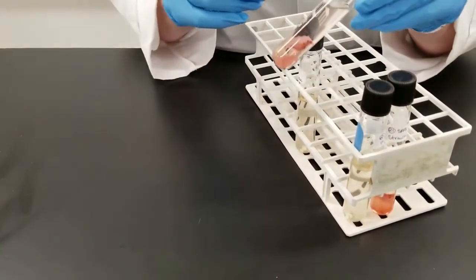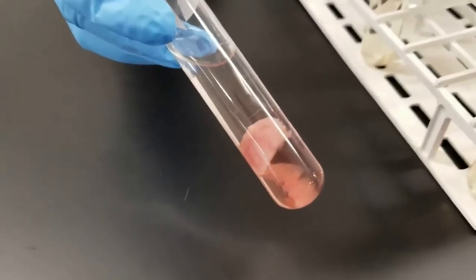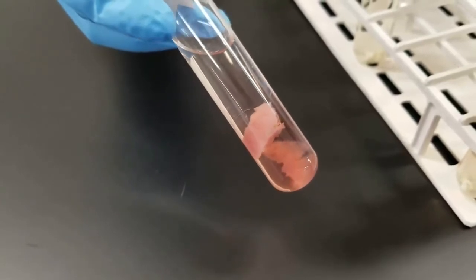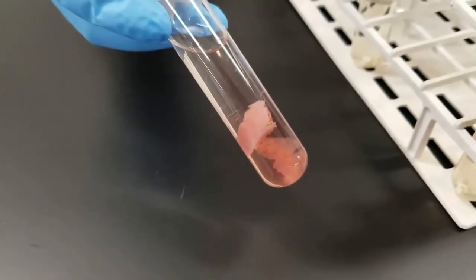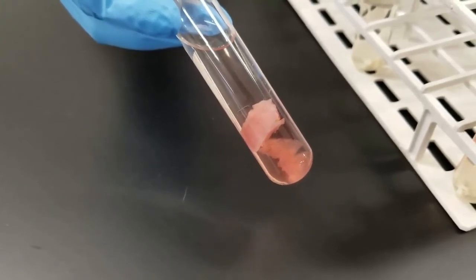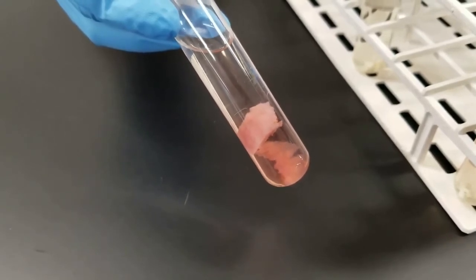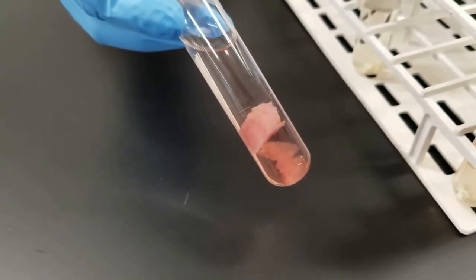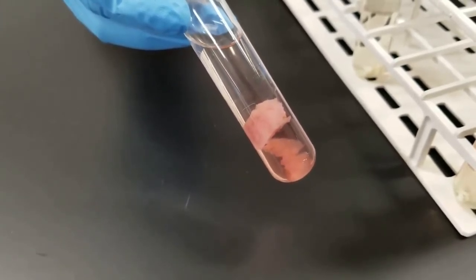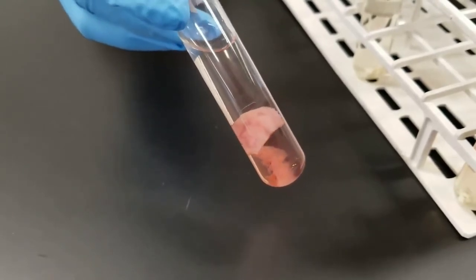This is the tube that we had strawberries in. This was incubated at 37. As you can see, the strawberries looked very good to the fungi. They're starting to grow in there. One thing about this, notice that the media itself is clear. If it was bacteria growing, that liquid would be turbid or cloudy. Fungi, when they are growing, they do not turn the surrounding medium cloudy at all. They're growing just on the source.